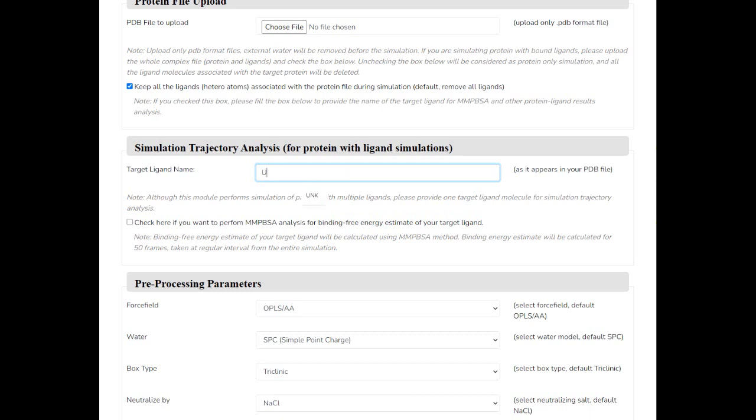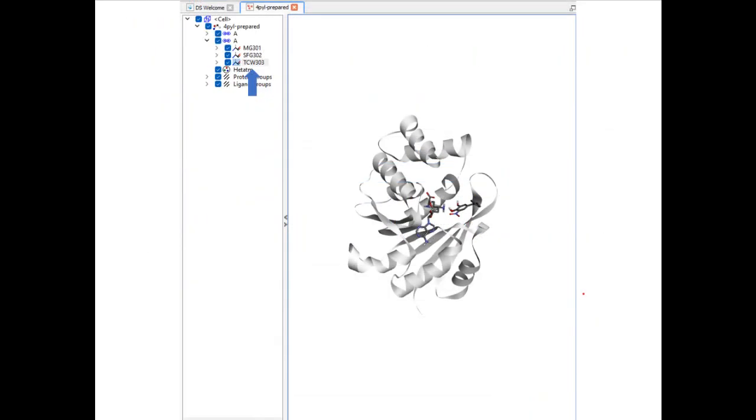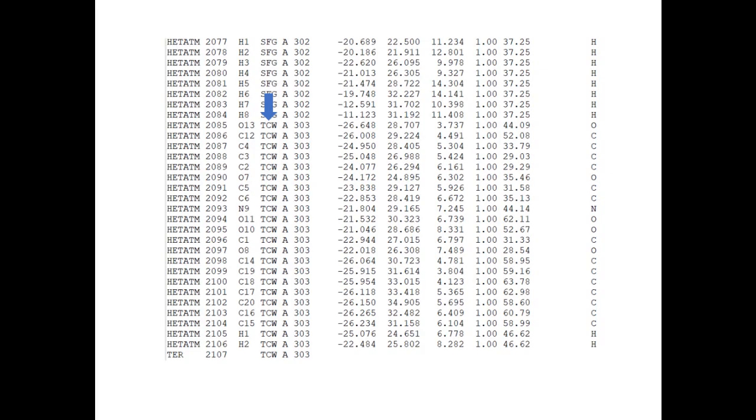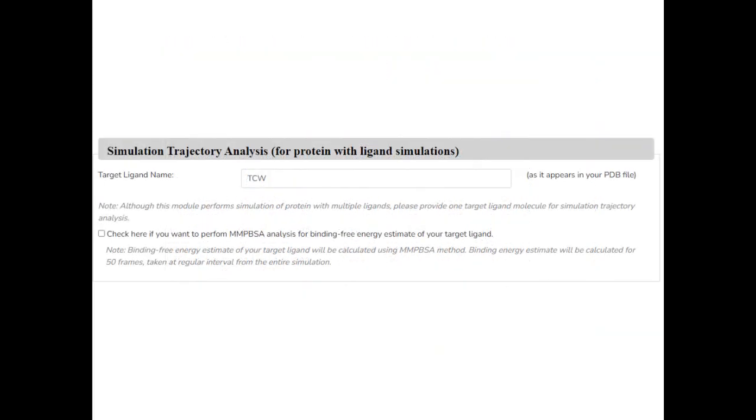In some cases, you will find ligand name as UNK or SUB. Just use the name as it appears in your PDB file, like UNK or SUB. You can find this information in the hierarchy view in Discovery Studio or from any text editor. In our case, type TCW.